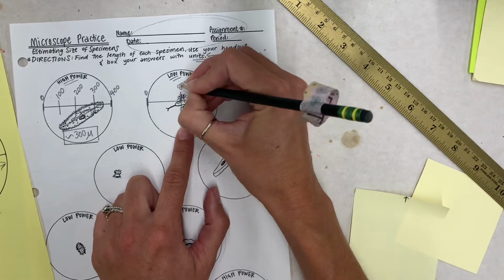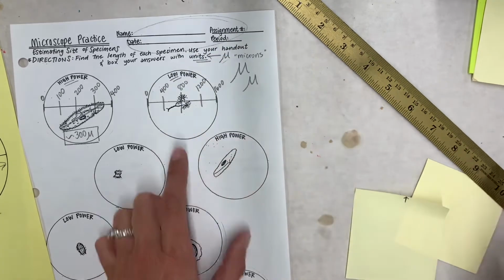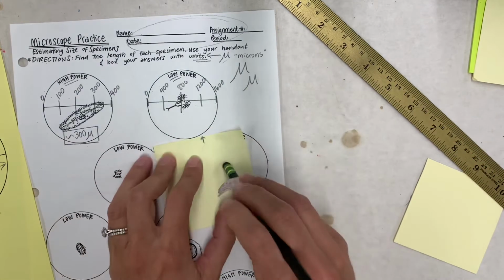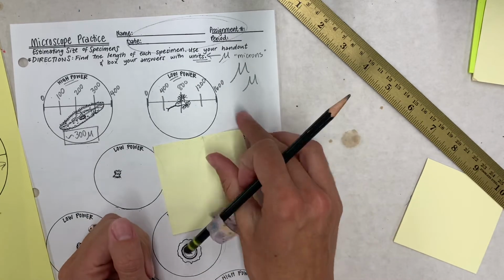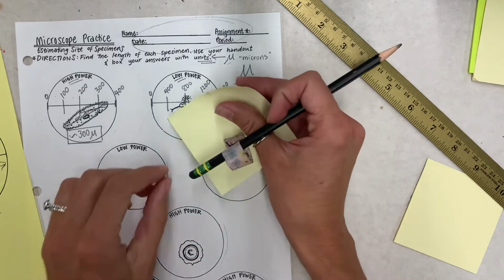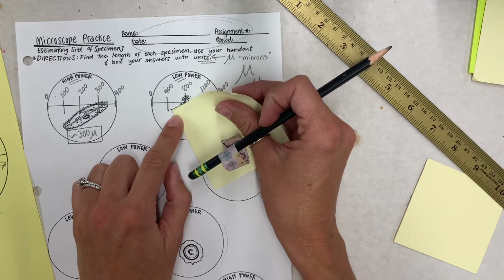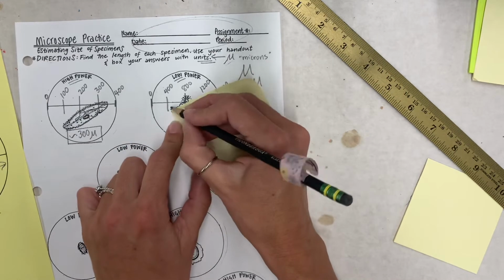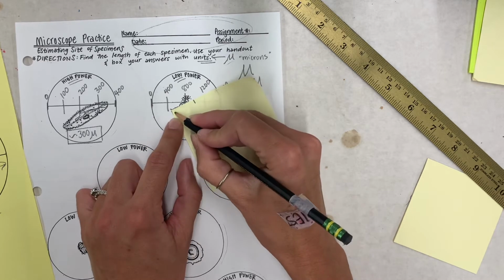find halfway, and what's in between. You're going to use your Post-it note again. I would suggest erasing your previous mark so you don't get confused. And again, we want to lay this flat down. Try to be symmetrical with your measurements. So you're going to lay it on one end and just kind of lay it down so it covers half of your specimen. And then we're going to draw a little mark to show where the specimen ends. We're going from here to here.